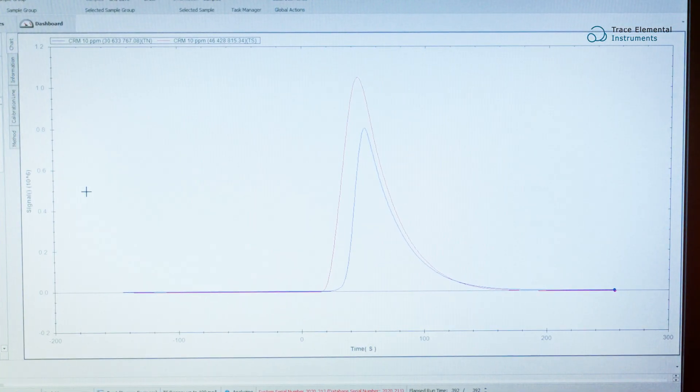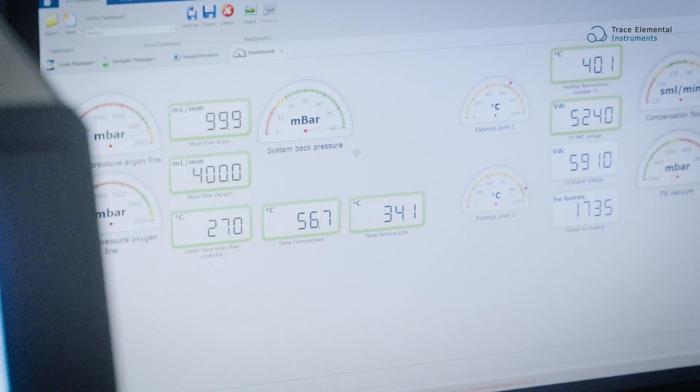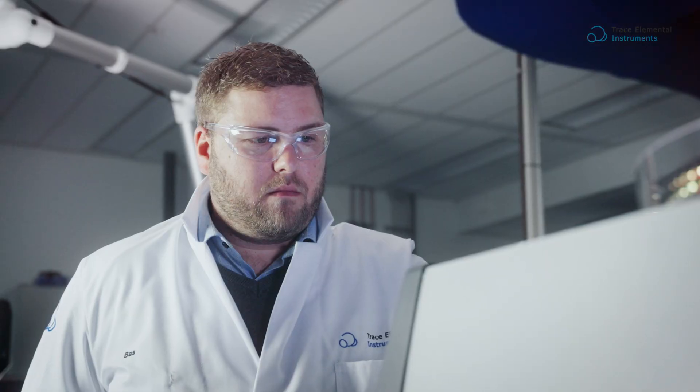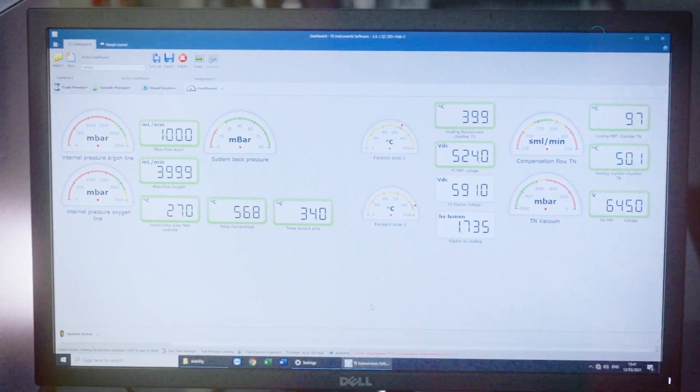The system can execute an in-depth diagnostics of system parameters and critical counters to assist the user in maximum uptime. Parameters like flow, temperature, and pressure are monitored.